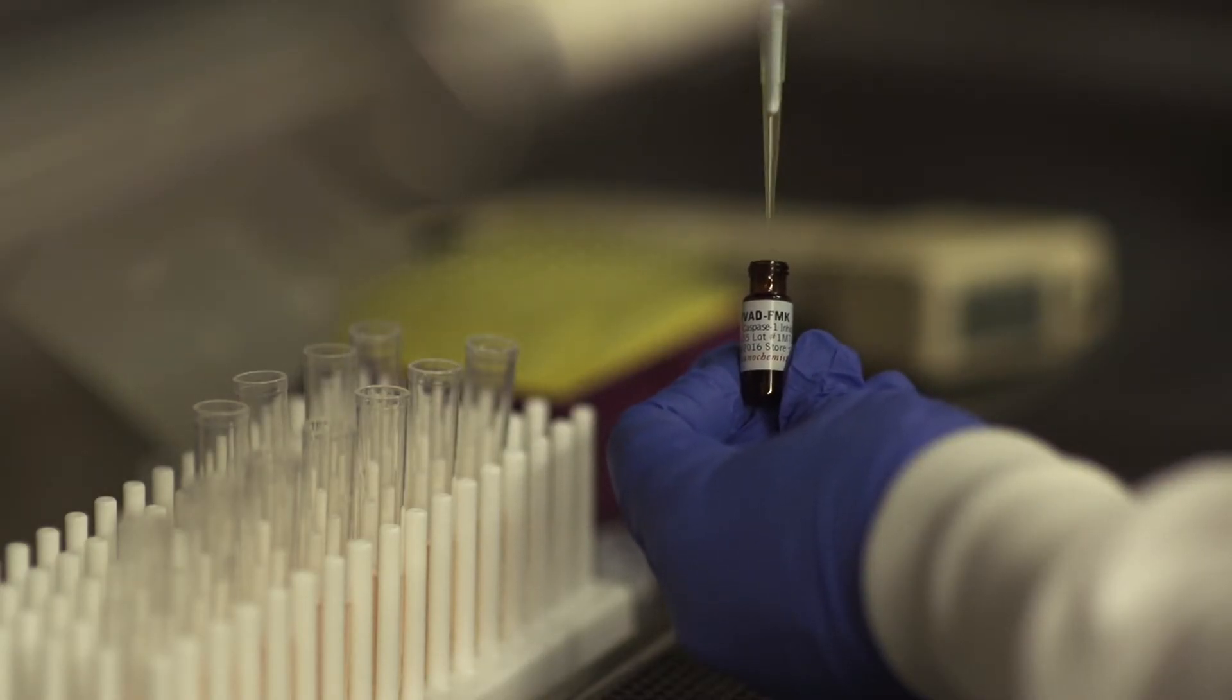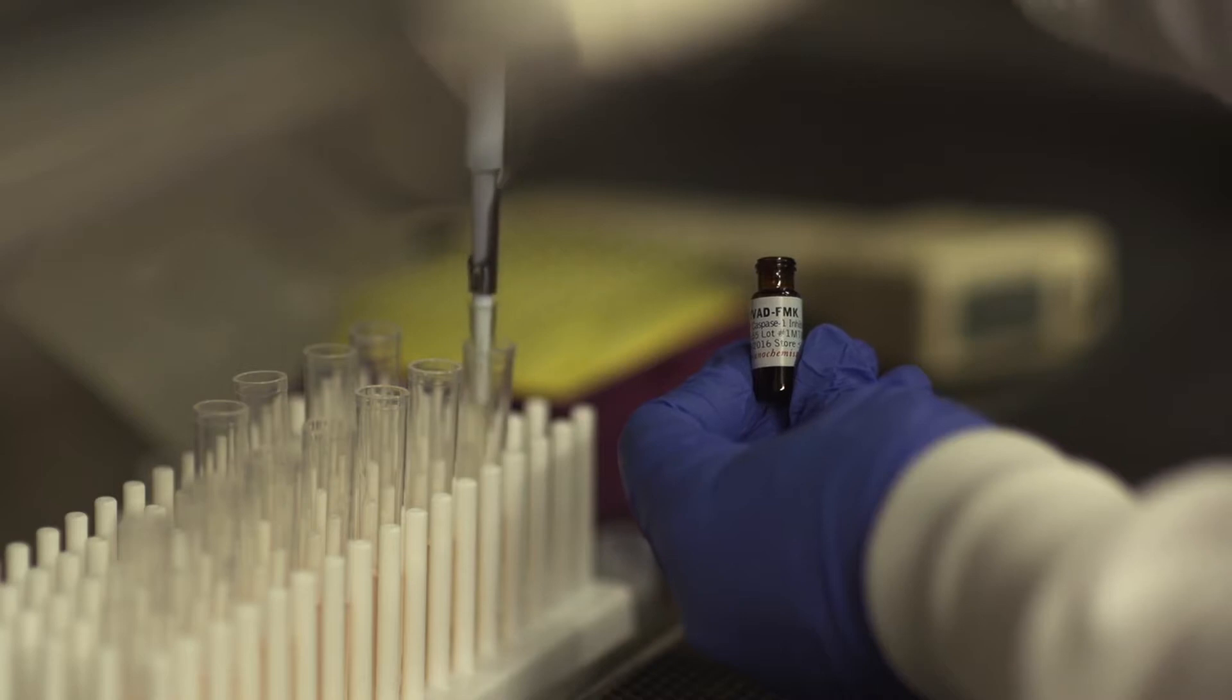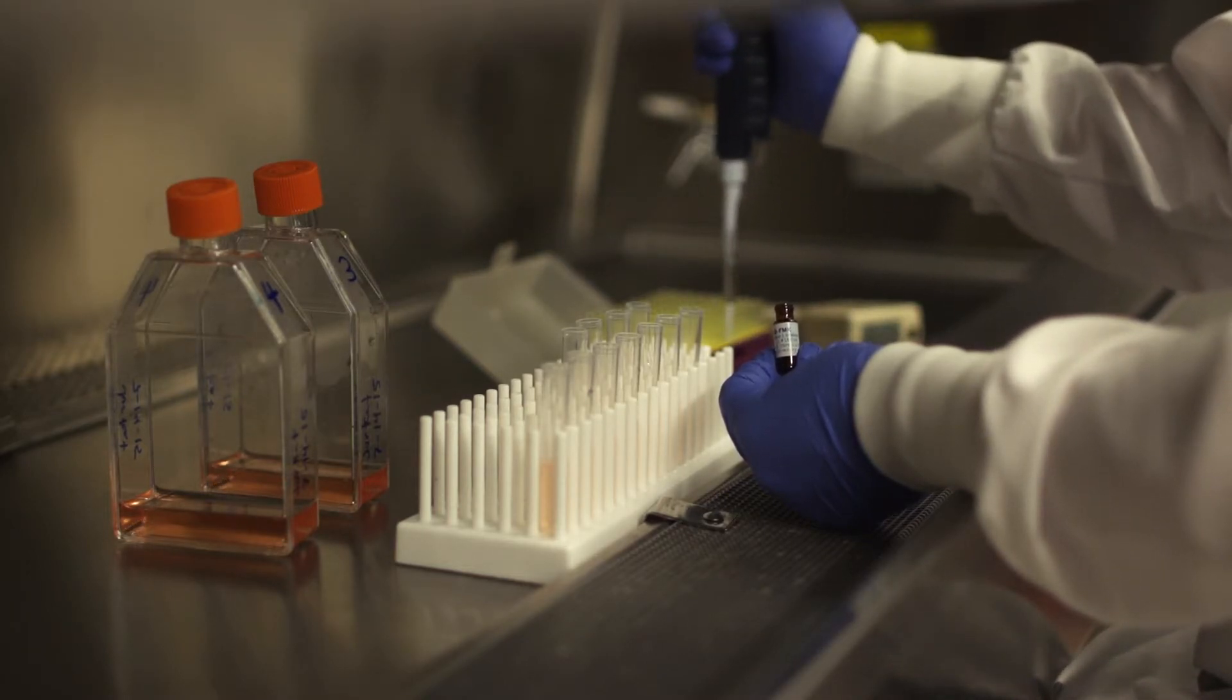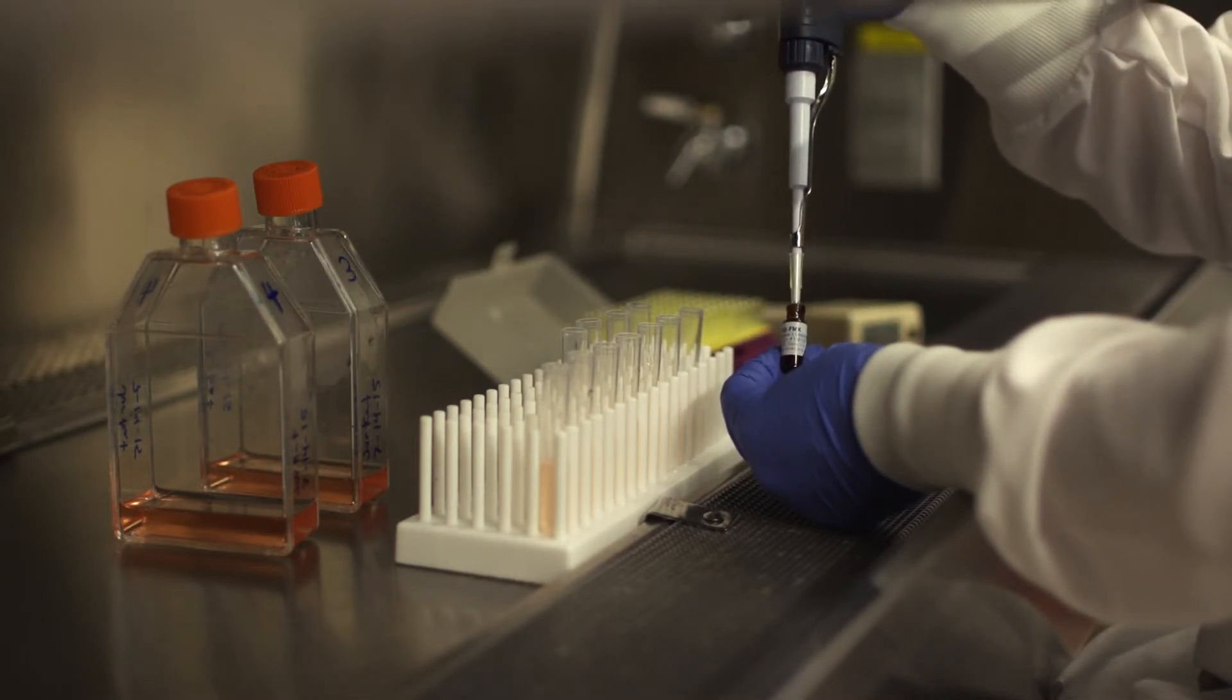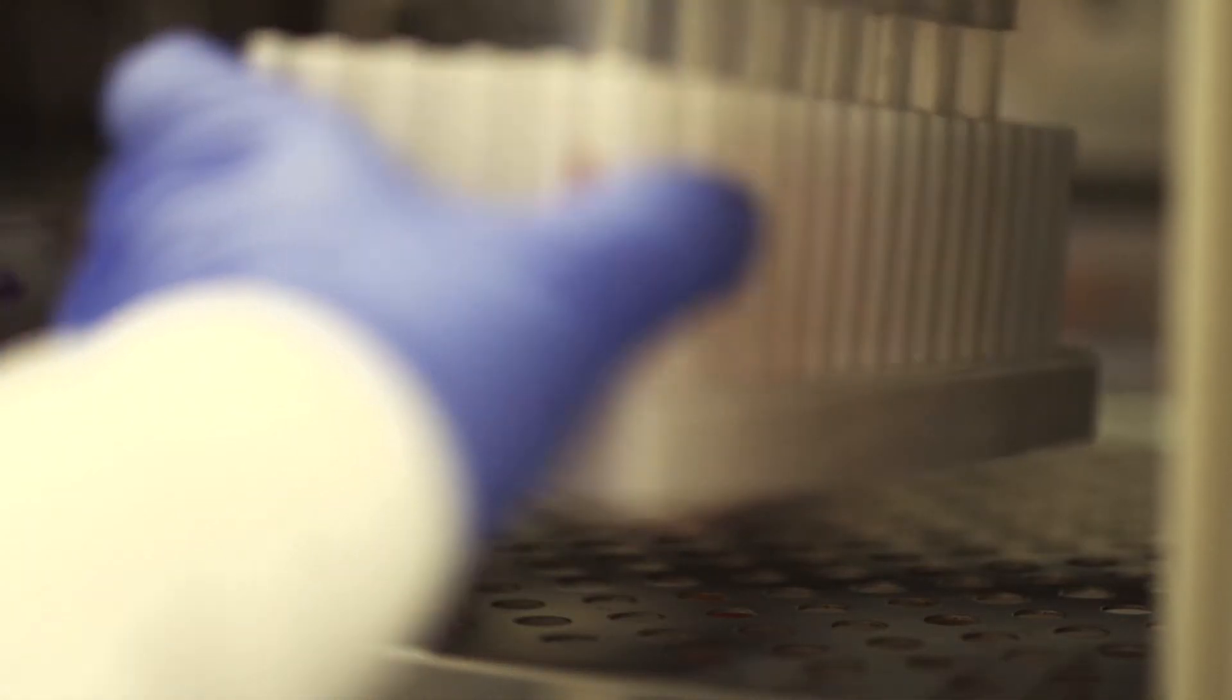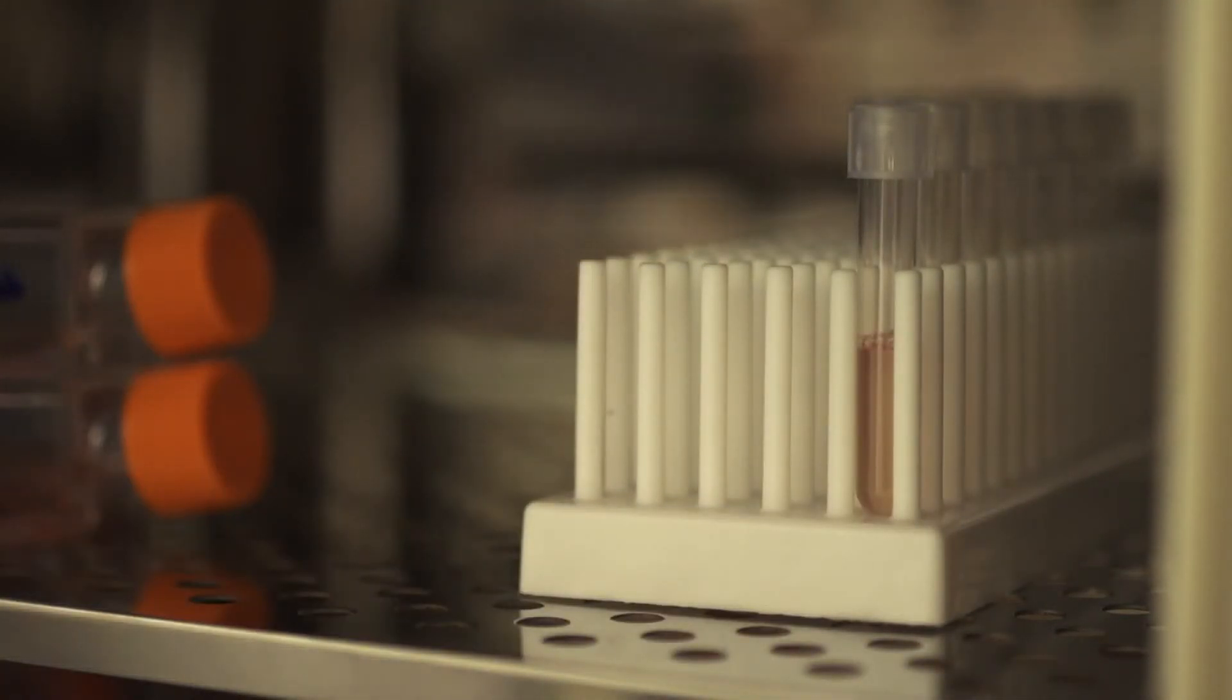FLICA is cell-permeant and will efficiently diffuse in and out of all cells. There is no need to lyse or permeabilize the cells. If there are active caspase enzymes inside the cell, they will covalently bind with FLICA and retain the fluorescent signal inside the cell. There is no interference from procaspases or inactive forms of the enzyme.